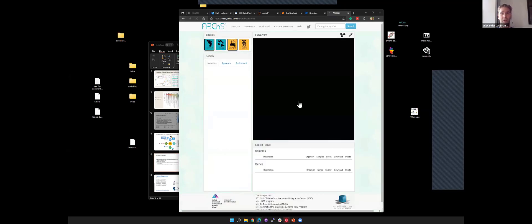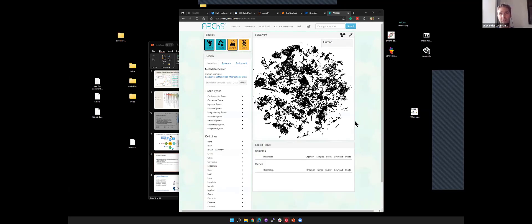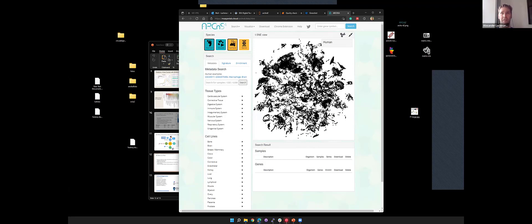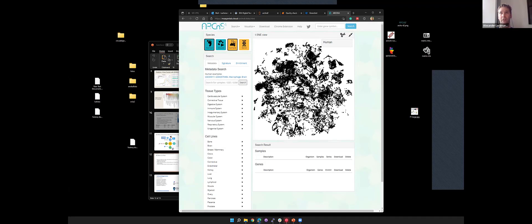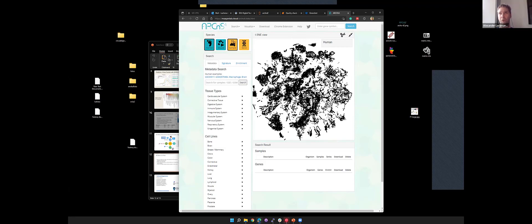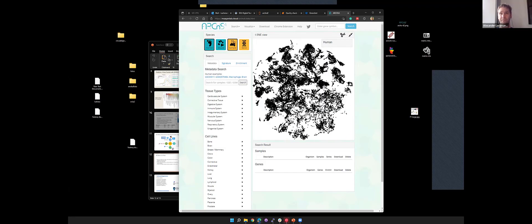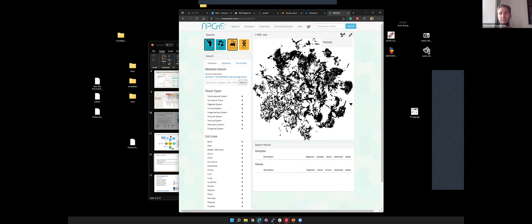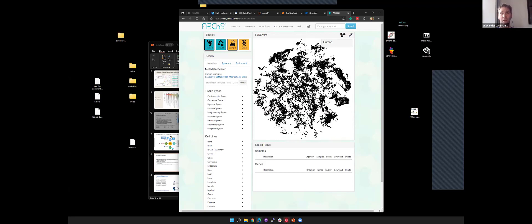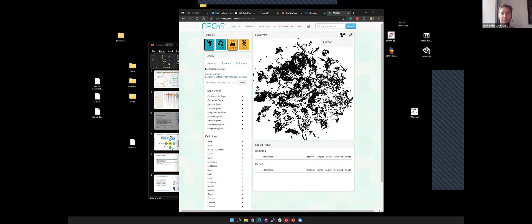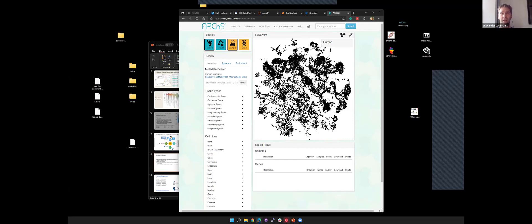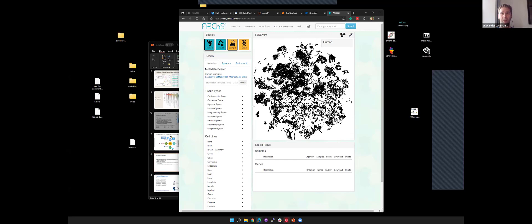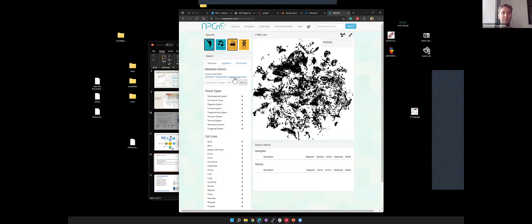Getting started. This is the main page for the data view. Here we have human data selected and we're looking at the samples. This is a three-dimensional representation of all the samples. Each point is an individual sample. This is a t-SNE projection of that data. You can see that the data is quite structured, and that's what we want to see.